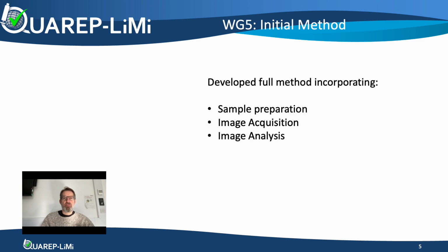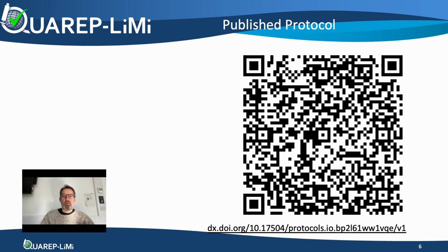We focused our attention on, first, sample preparation, second, image acquisition, and third, image analysis. All of this work culminated in the first version of a protocols.io manuscript, which gives a method for creating the bead slide, imaging it, and the metrics to capture from the analysis.